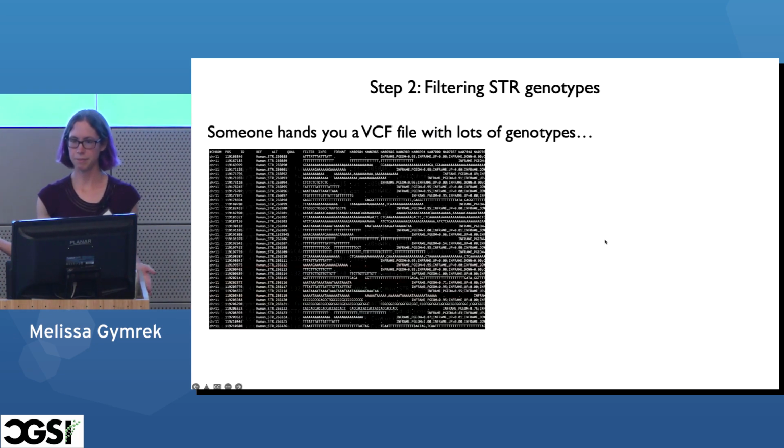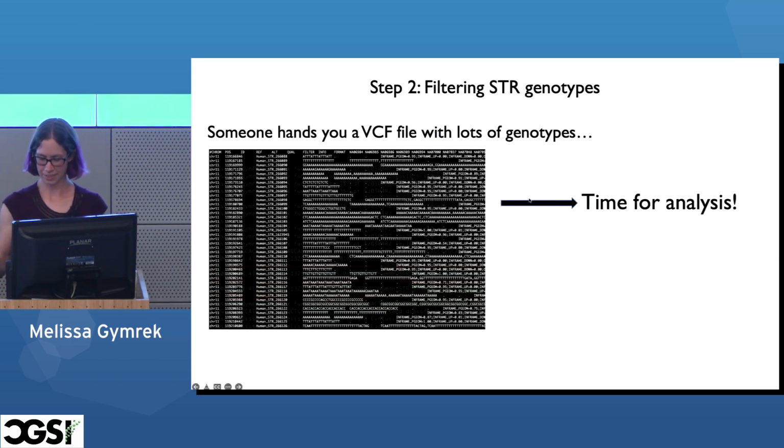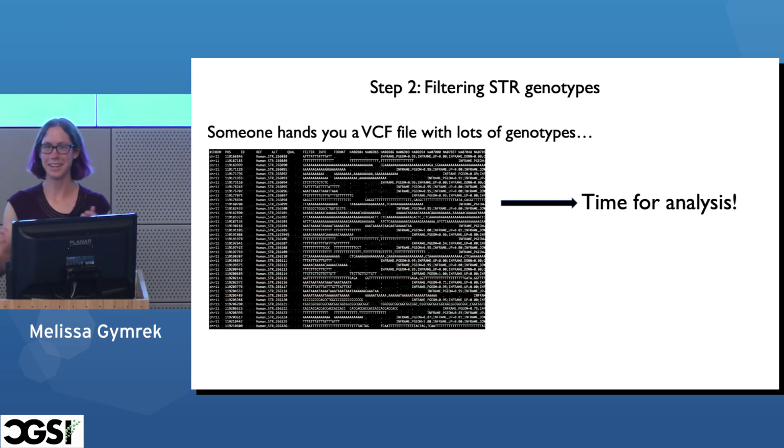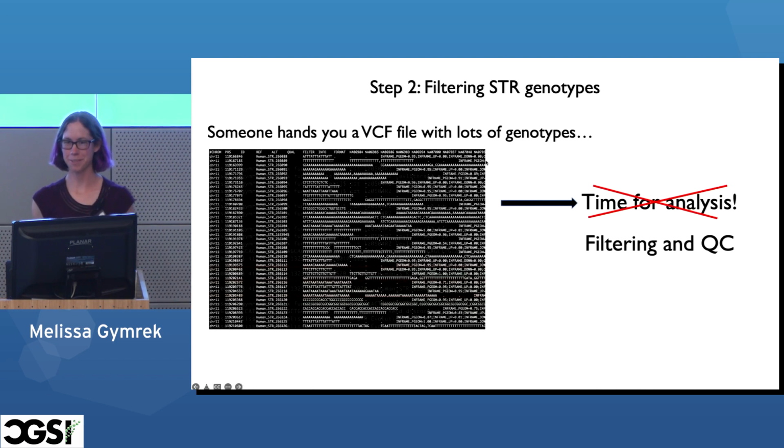Okay, so we have our big VCF file of all of our STR genotypes across the genome. We're ready for analysis, right? Right, yes. Why not? Okay, we're not ready for analysis yet, because first we have to do some filtering and QC.